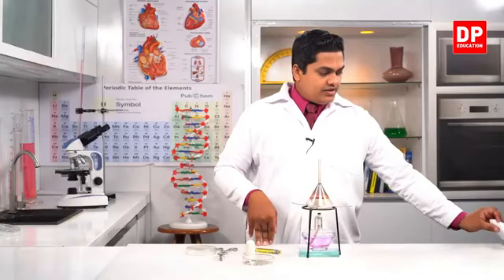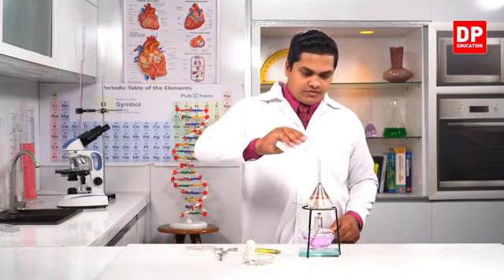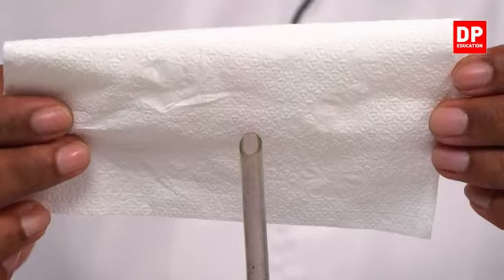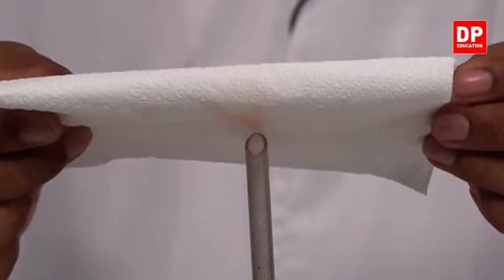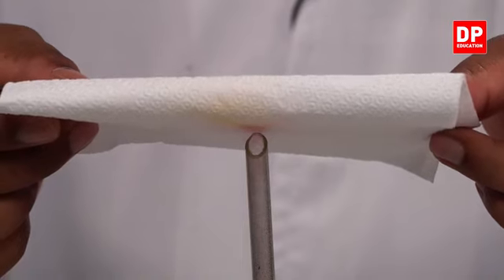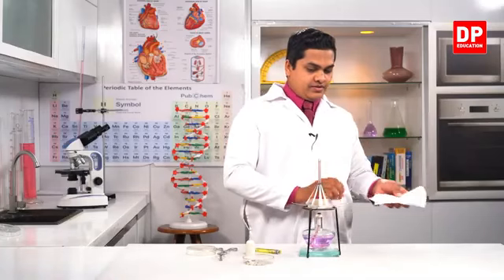So I'll use this tissue paper. You can see a light purple color gas which is getting emitted from the system. A light purple color gas, see?